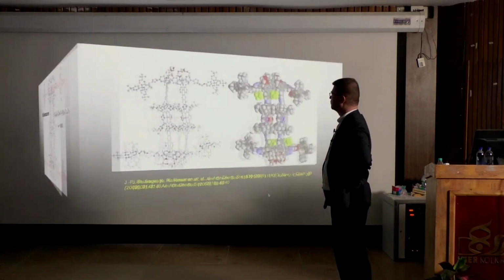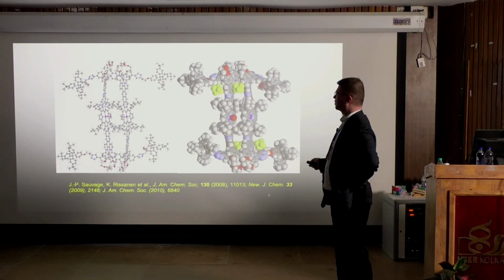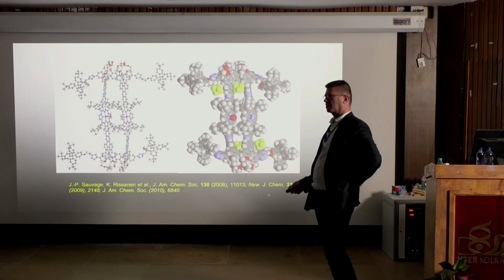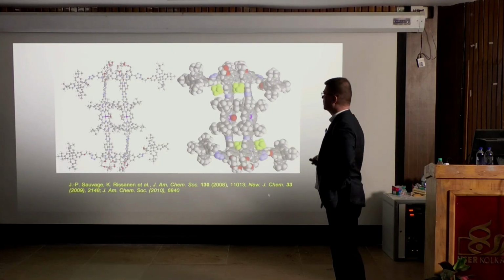So actually we were able to do this with our in-house instrument. And now this is the X-ray structure of that. Here you can see, it's curved a bit in this direction. So in here too, and the zincs are there. And we could even see that there is a molecule attached to the zinc. A water molecule is attached to the zinc. So we get more information from this, but that was really the idea.